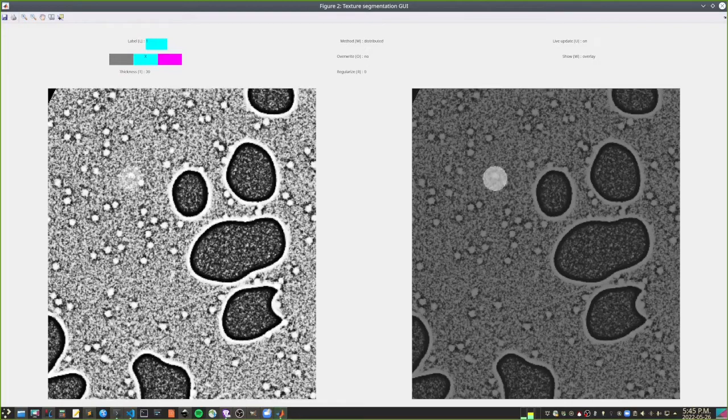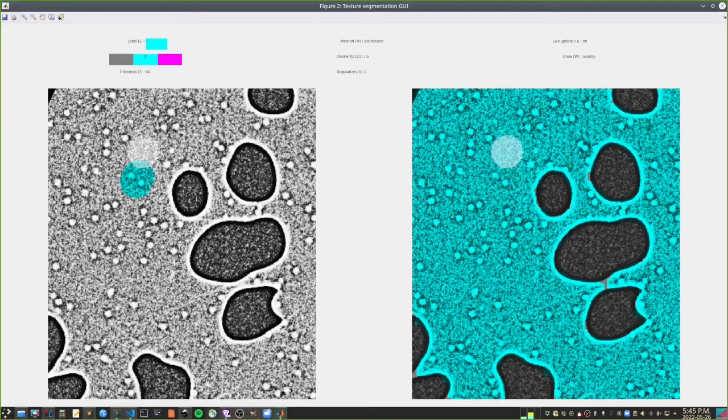Okay, so with the up and down arrows, you can increase or decrease the spot size. Basically, I find a region with a few fibers. First I give it blue for everything, and then with a smaller spot size, you want to be careful not to go beyond the true region, so it takes a little while. So you go carefully. Basically, the more effort you spend at this stage, the cleaner it's going to be. So you can already start seeing the effect on the right hand side.